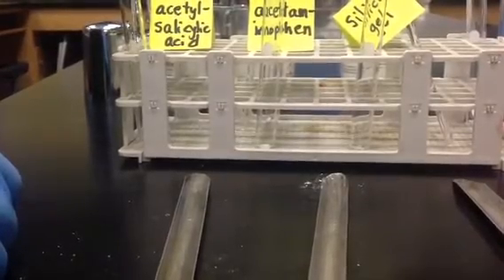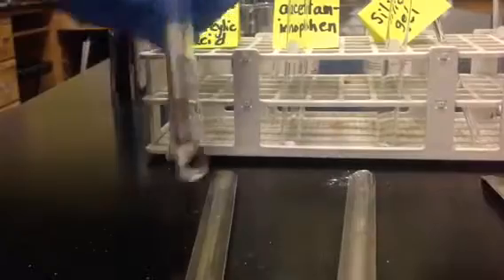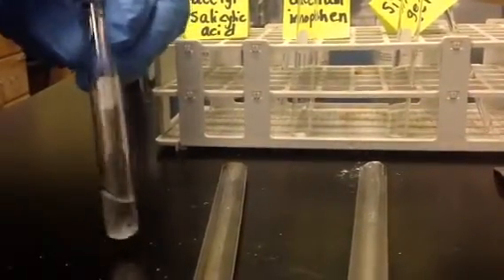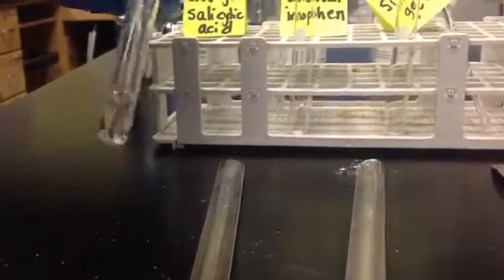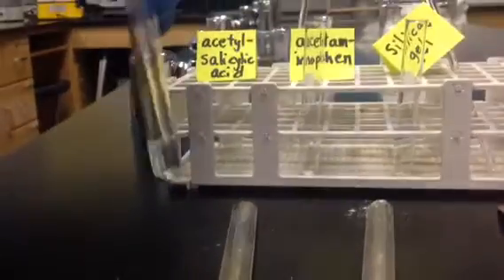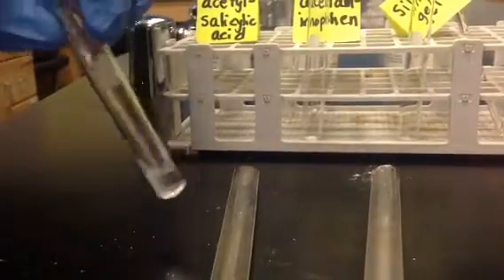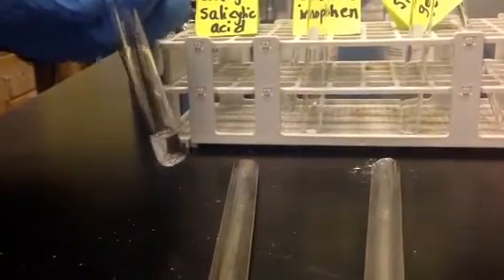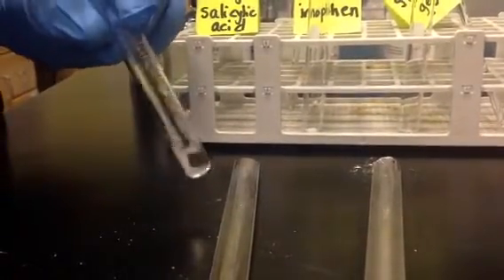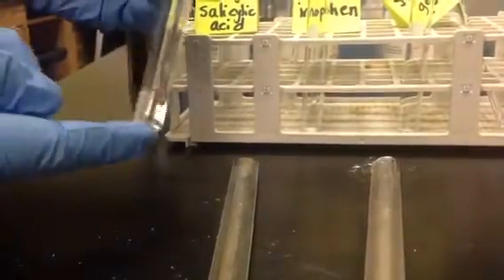So I add a milliliter. And we need to look at what's happening to that. The solid at the bottom, is it dissolving, yes or no? You may have to take a stirring rod to see if you can get it to dissolve. And it's going in. I have a few grains that are not going in. So you may have to vigorously mix it, but don't ever jam a stirring rod in at the bottom of the test tube or you'll break it. You just want to do circular motion to stir the liquid. You don't want to add any force on the bottom of the test tube.